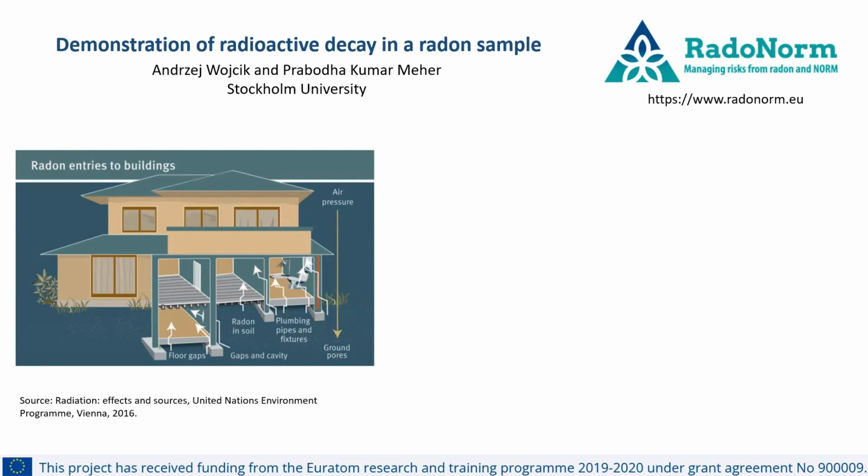At Stockholm University, we are focusing on analyzing how radon interacts with cigarette smoke in inducing cell damage and consequently cancer. To this end, we have constructed a special cell exposure facility, and we will use this facility for the demonstration. However, the focus of the demonstration is not on the interaction of radon with cigarette smoke. Rather, we want to visualize how radon decays into its daughter products.